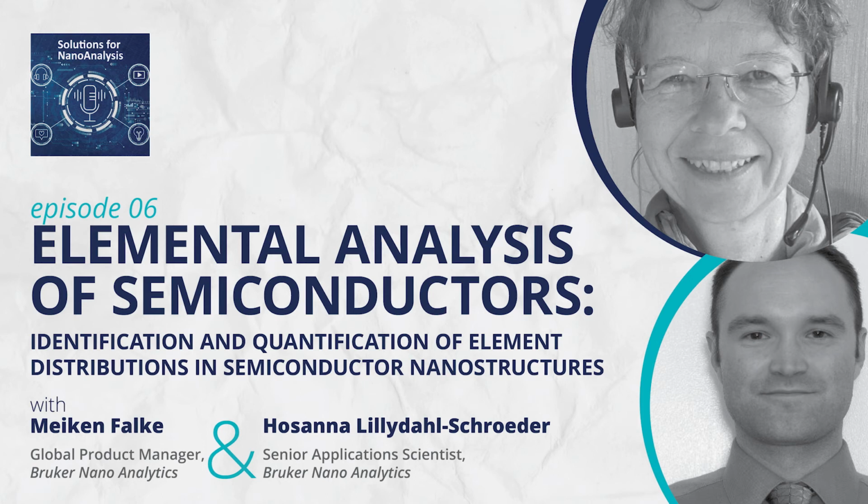The better the microscope, the better the outcome for EDS, and the better the EDS technology, of course, the better the result will be. If we have a combination of a high-end microscope with a high-end EDS detector, that would yield even better EDS results.